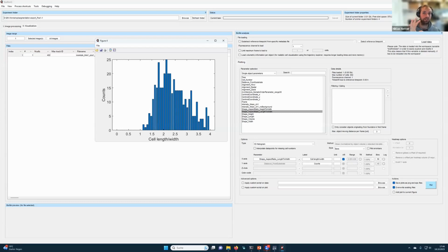Yeah, so the cells here could in principle be curved and have a shape that is different from a perfectly convex shape. And yeah, we have not compared convexity estimates for different samples so far, I think, or for different segmentation methods. However, we have used these measurements here already to measure the convexity across species, and there it worked out.